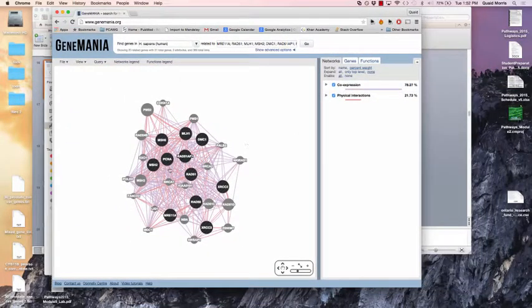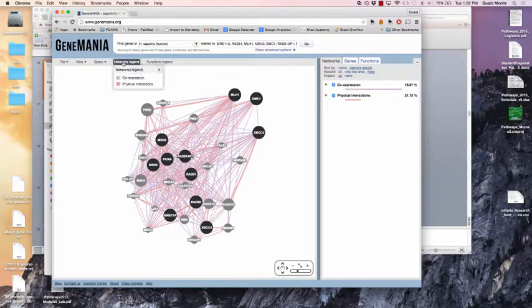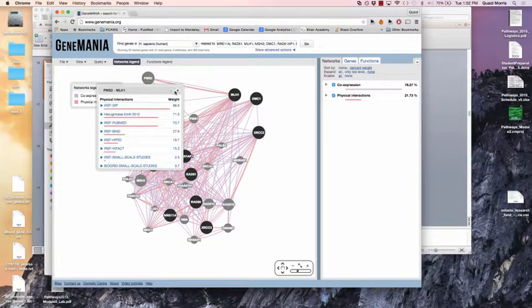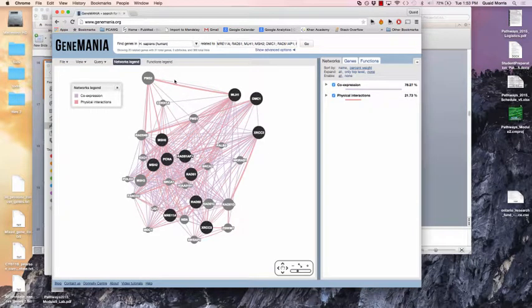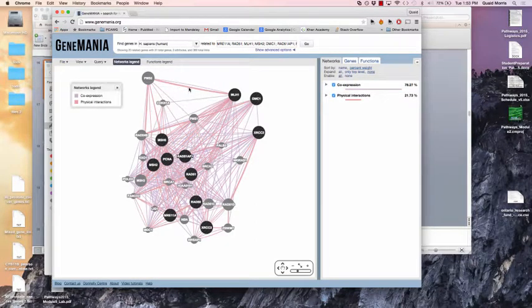We can look at the output that we got. The black genes are the ones that were originally in the list. The links are colored based on what data source supports them. Some links are supported by both physical interactions — these two genes have been shown to physically interact in multiple studies — and also by co-expression. This line is thicker because there's more evidence for physical interaction than co-expression.